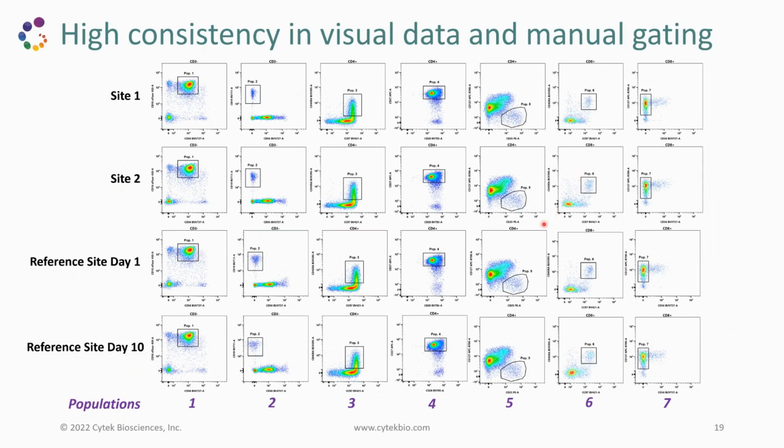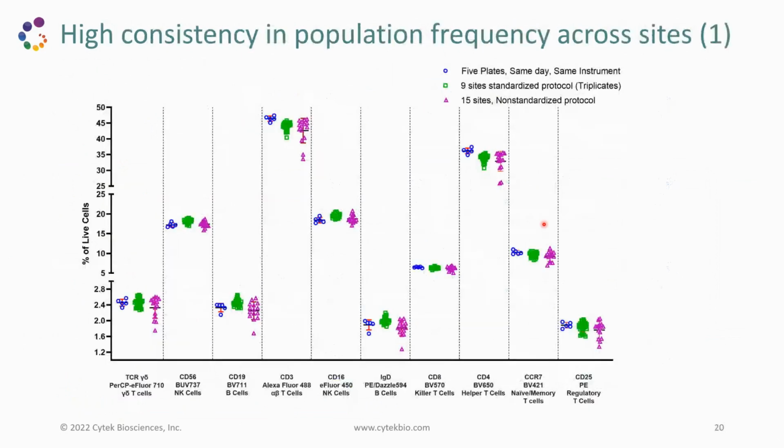It was impossible for me to have a clear slide showing you plots from every site where we have collected data. But trust me, we can use exactly the same analysis template to fit the data coming from all the different sites that we have been using for this study. So now, if we look at the population frequency that is identified, and again, we're not tracking all of the populations, but if we look at some of them.